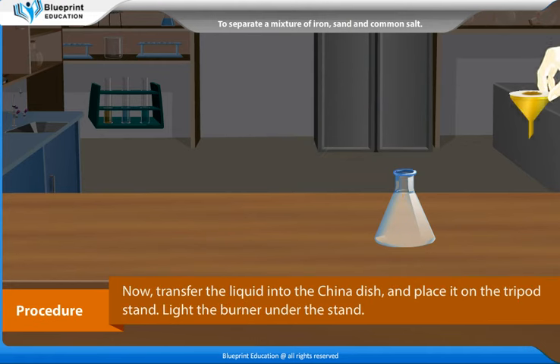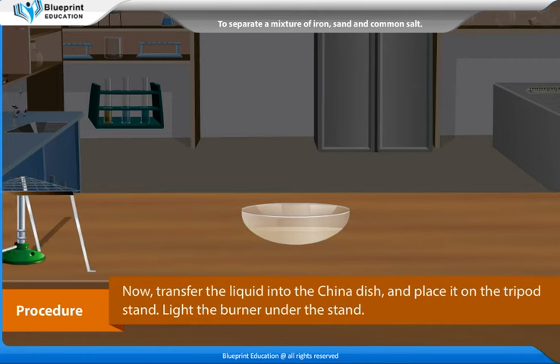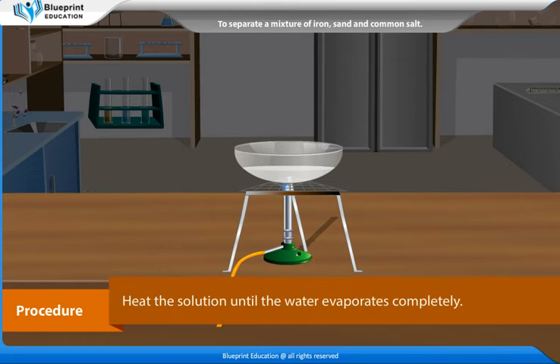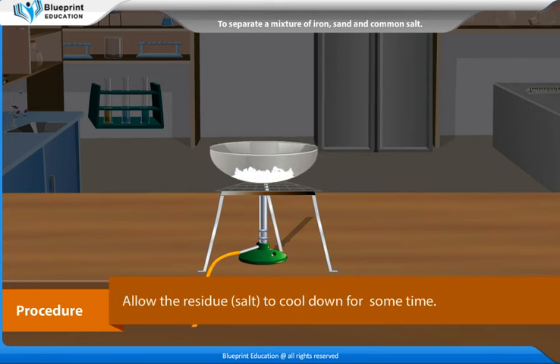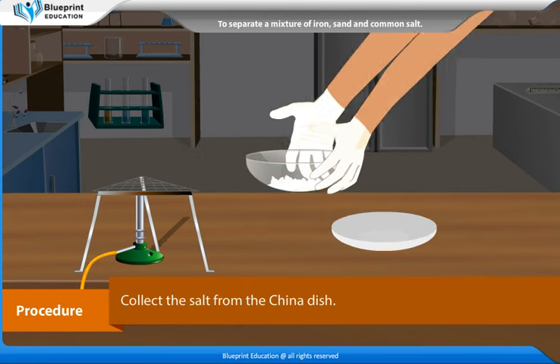Now transfer the liquid into the china dish and place it on the tripod stand. Light the burner under the stand. Heat the solution until the water evaporates completely. Allow the residue — salt — to cool down for some time. Collect the salt from the china dish.